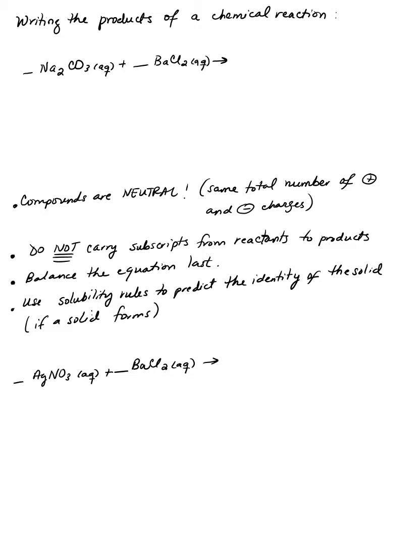When mixing two solutions, if an actual chemical reaction is happening, you will be able to identify that a chemical reaction happened by observing what is happening in your mixture. So if the temperature is changing, sometimes that means that it's a physical change, but sometimes it means that you have an actual chemical reaction happening. If you were able to detect a temperature change during this experiment, then it means that an actual chemical reaction happened.